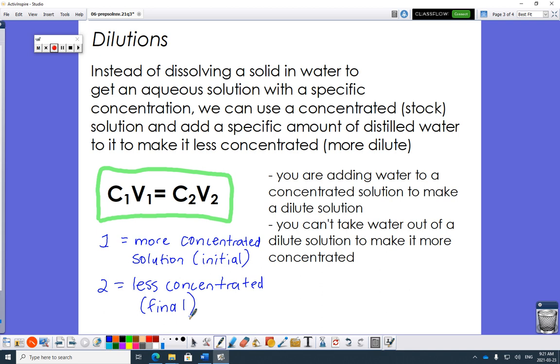So when you make measurements, especially when you're doing something like this, you should definitely not use the beaker, okay? The beakers are just there to be your vessels to hold your solutions. Their calibrations, I think ours have 5% error. That's way, way too much, okay?